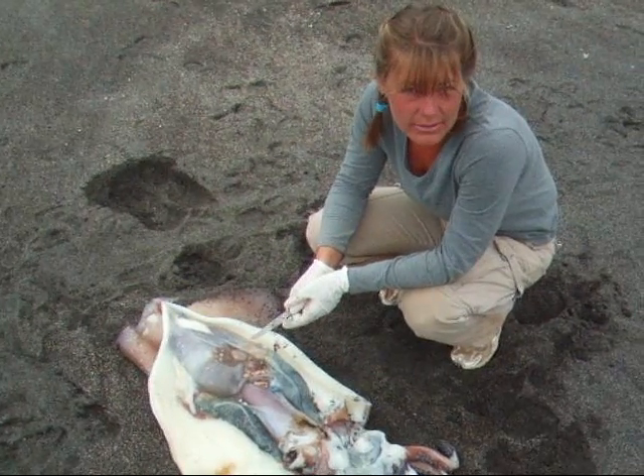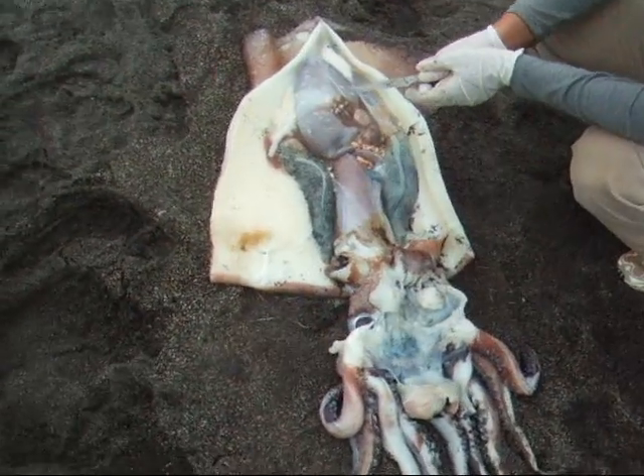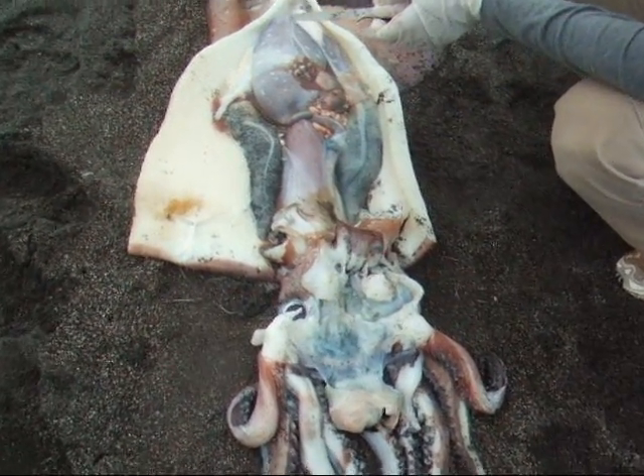So that wraps it up. We've taken a look at the squid's external and internal organs, and we're going to call it a day.